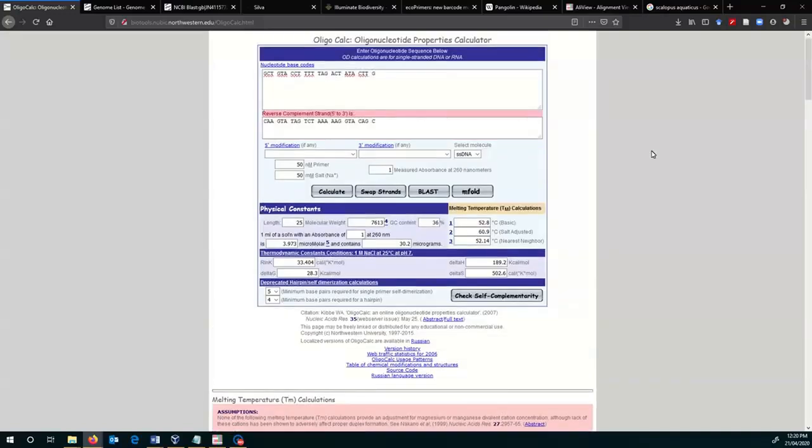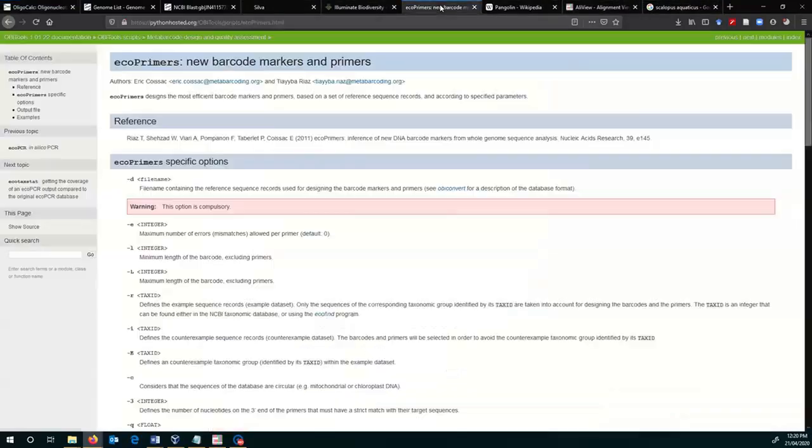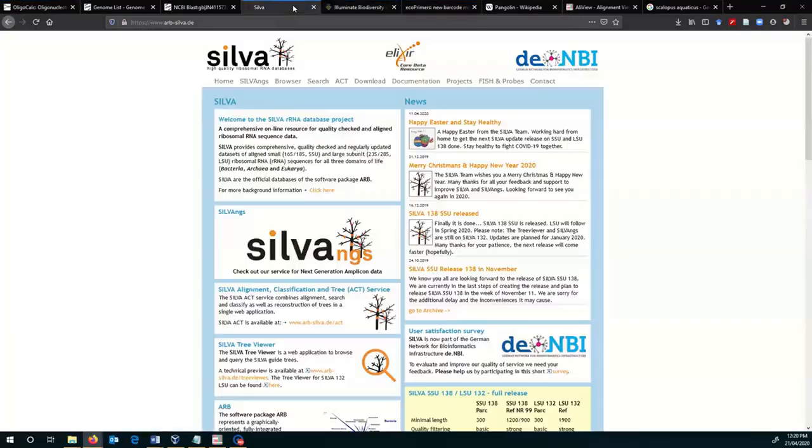I think that actually looks pretty good to me. I would just buy them because they cost about $60 to buy that primer pair, and start testing them out. I get some pangolin DNA and some other DNA and test empirically to show that it doesn't work. And that's essentially what people do with any of these kind of things, like that paper I showed you earlier where people had empirically tested it.